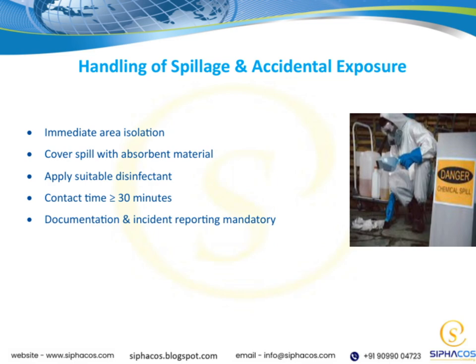Remember, the disinfectant needs to stay in contact with the surface for at least 30 minutes to be effective. Lastly, documenting the incident is mandatory, along with reporting it properly. This ensures proper follow-up and helps maintain a safe environment for everyone.